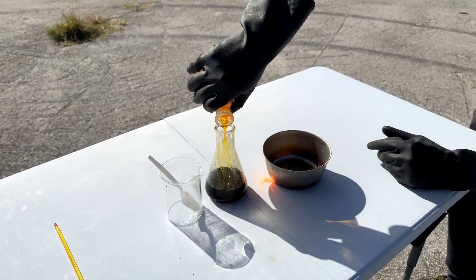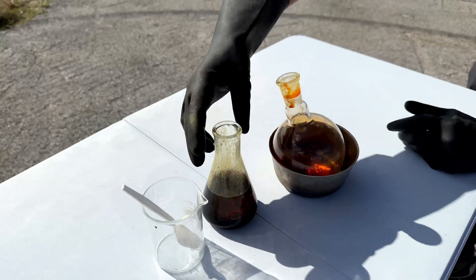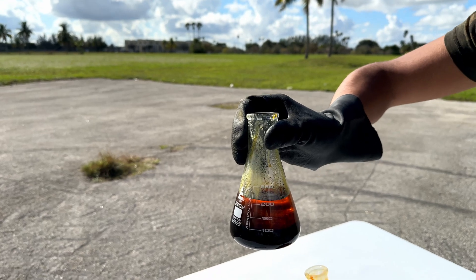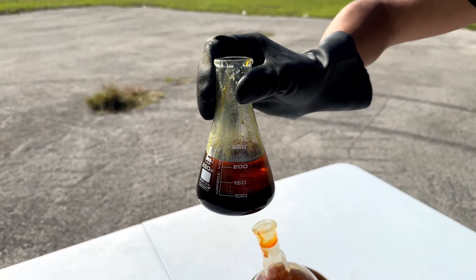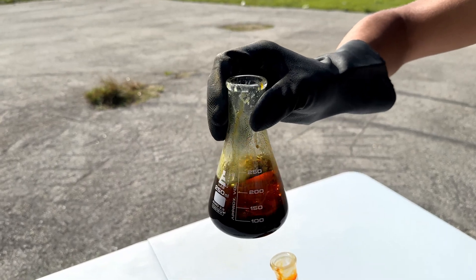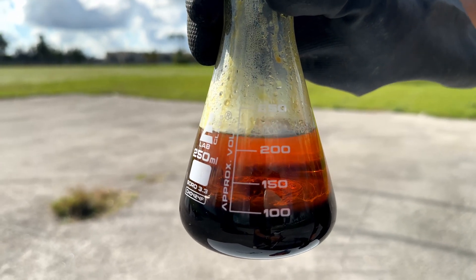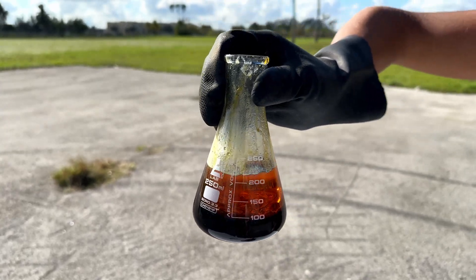We're also going to see our separation. Notice something: oil regularly floats on top of water, not the other way around. The way we know for sure that we made our brominated oil is that our oil is on the bottom, because brominated vegetable oil is 1.3 grams per cubic centimeter. This means it's denser than water, which is only 1 gram per cubic centimeter. You can see our bromine water is still full of bromine, which means our oil is fully saturated — it cannot take any more bromine.